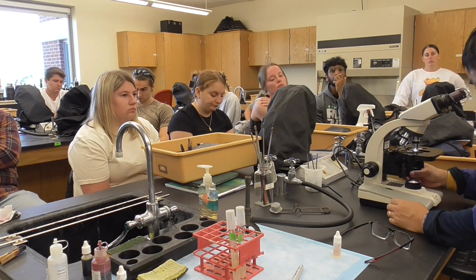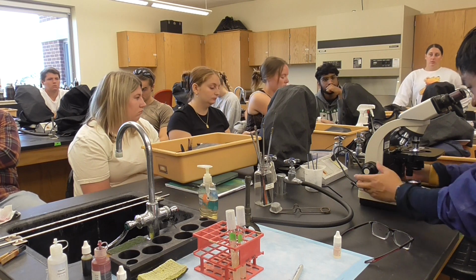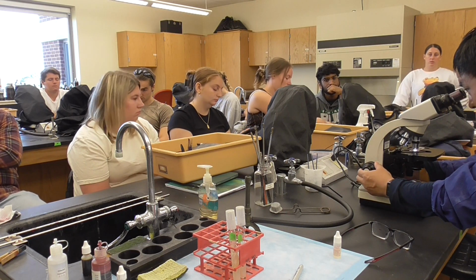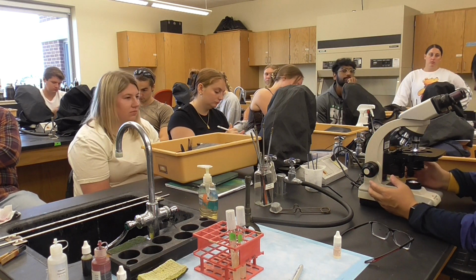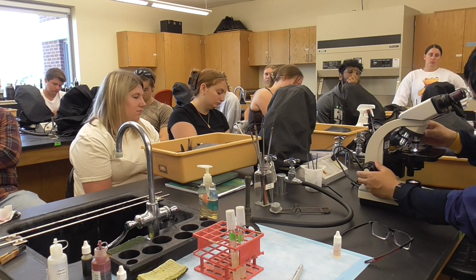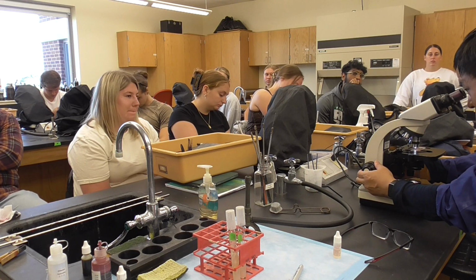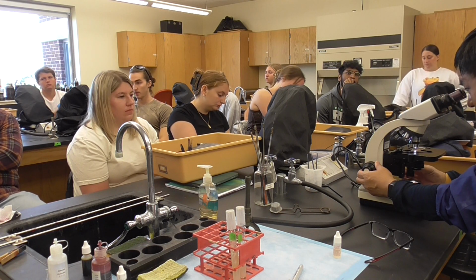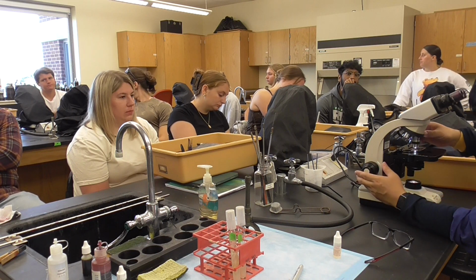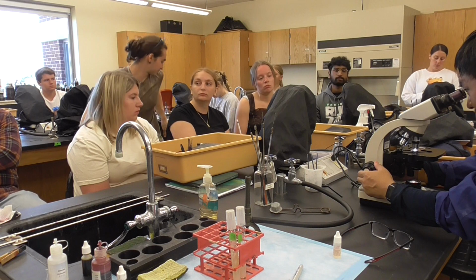Lactobacillus should be gram-positive. So we'll see what it looks like. Maybe it works, maybe it doesn't work at all. Maybe it's rinsed off. I didn't find anything, so I have to readjust. So let's go down to see whether we find something. Remember, it was a little bit off, so we're going to see whether I can see it.